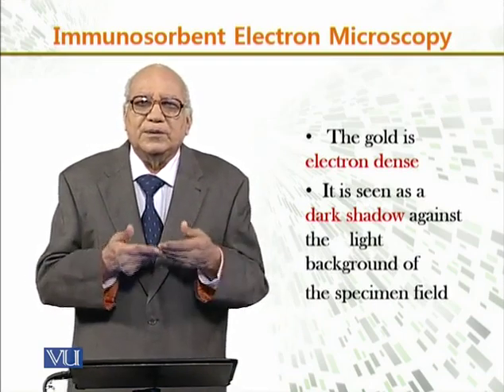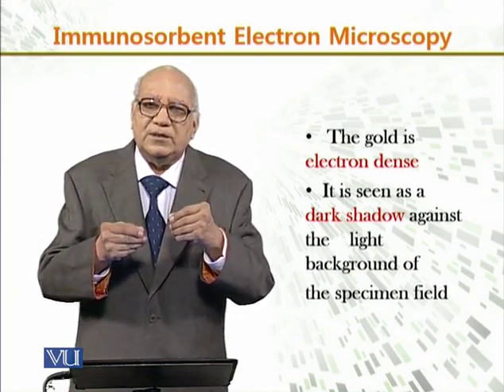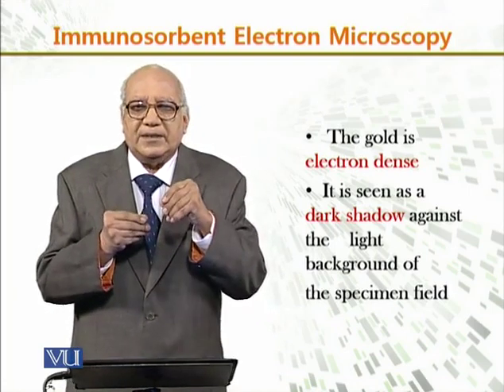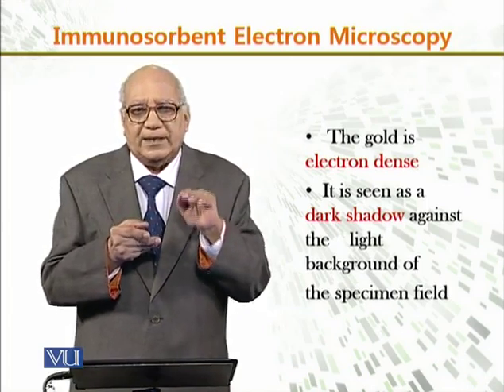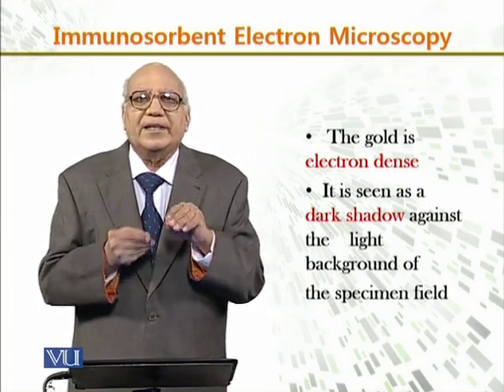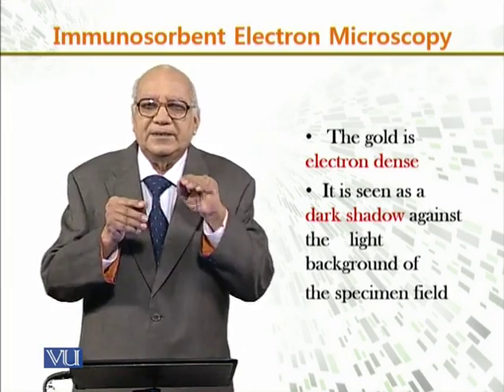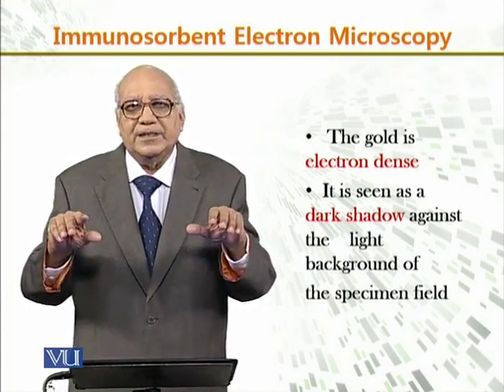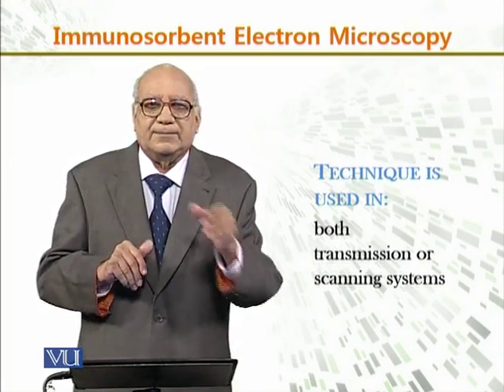particle. So similarly, gold is an electron dense compound, and it is seen as a dark shadow against the light background, because it doesn't let electrons pass through it, and in the light background of the specimen field, the virus will appear as dark.